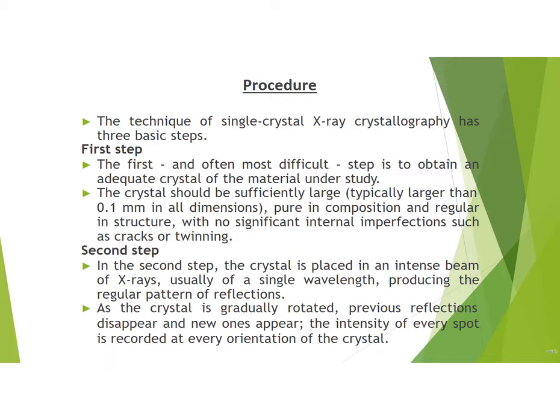X-ray crystallography is used to find the crystal structure of an unknown material, to measure the average spacing between the layers of atoms, or to determine the orientation of a single crystal. Elucidation of a molecular structure is becoming more common owing to the development of various measurement techniques such as NMR, MS, and IR spectroscopy. However, these spectroscopic techniques derive just a list of partial structures, and it is sometimes difficult to deduce the 3-dimensional structure of a whole molecule.